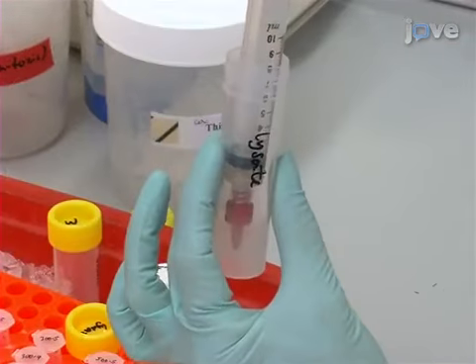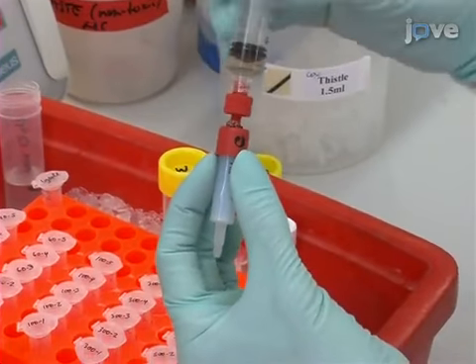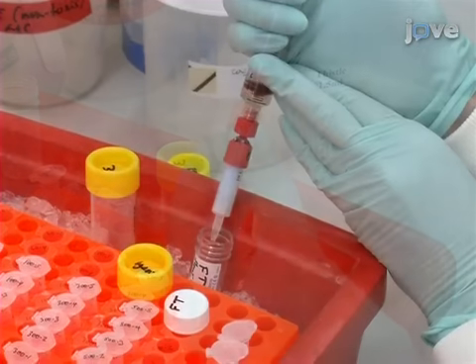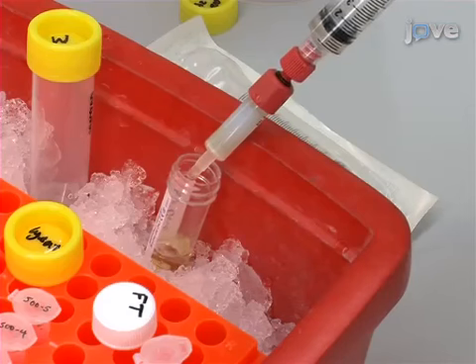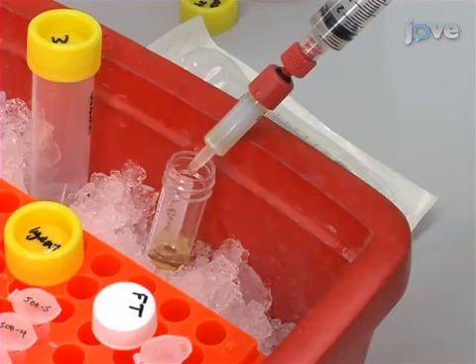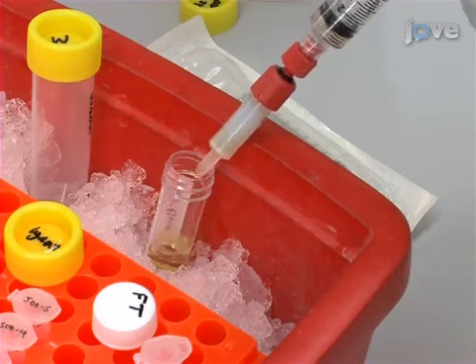Next, load the lysate onto the column. As the lysate is loaded onto the column, significant backpressure may be experienced. This is perfectly normal. Do not be tempted to apply too much force to the syringe; maintain a steady, even pressure. It is usual to see a mild color change as the lysate enters the column.